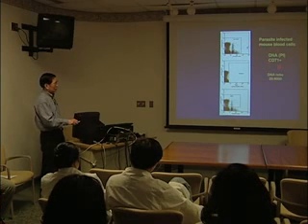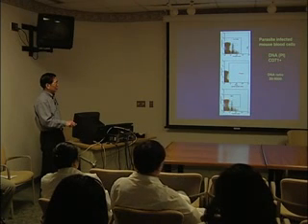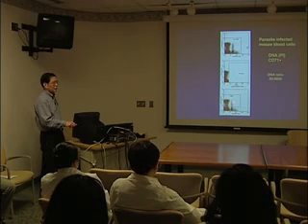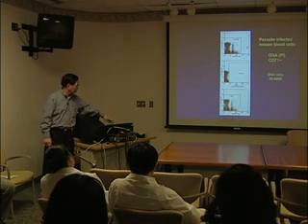You don't have the platelet marker, so you don't have anything here, but you do have reticulocyte plus some of the parasite-infected red blood cells. You look at the final product, you see micronuclei, you see the reticulocyte without micronuclei. Where do you get this micronuclei?